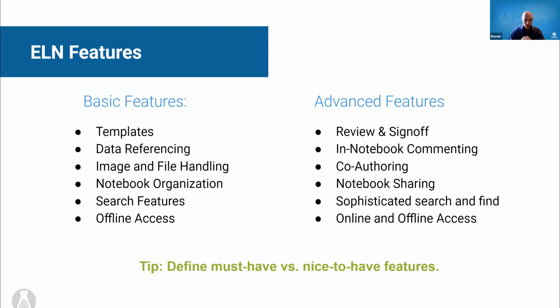Notebook sharing. Can you simply take your composition and proffer it to your regulatory affairs department for their composition for an FDA submission? Can you send it to a colleague or a collaborator in a complete form that they can extract what they need from it? This is really nice to be able to do. Some ELNs make that easier or harder. Certainly worth exploring.